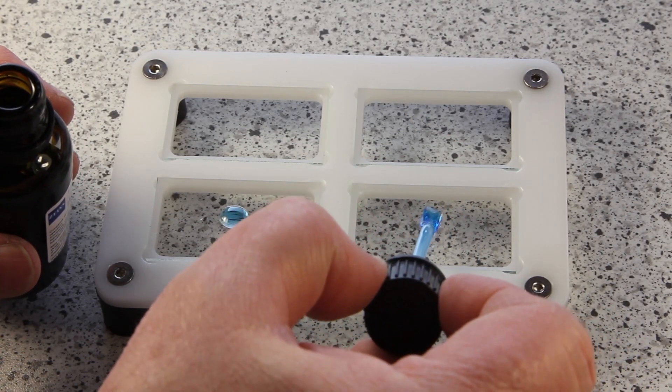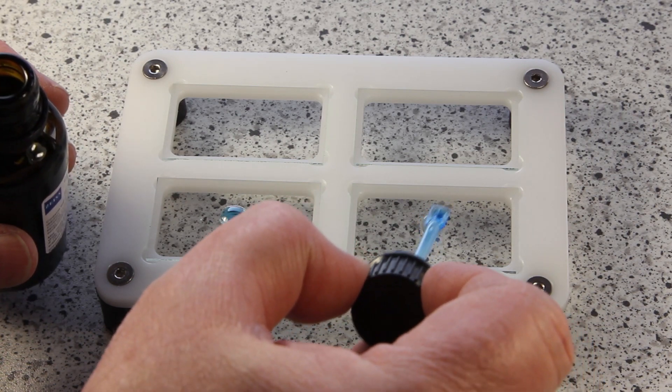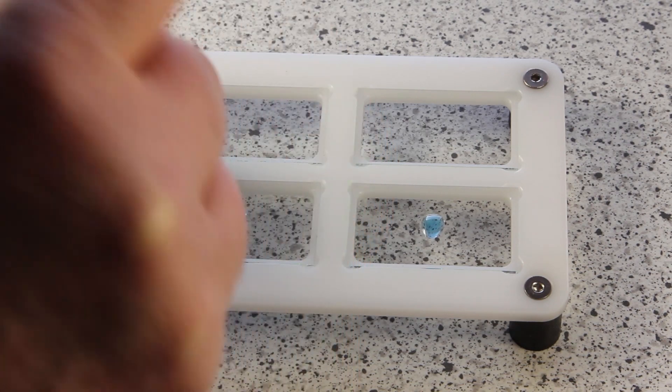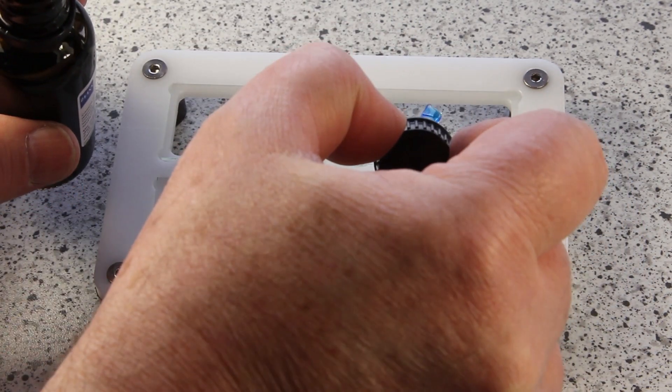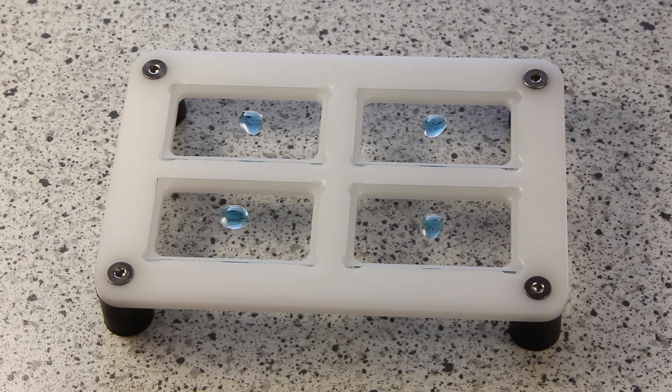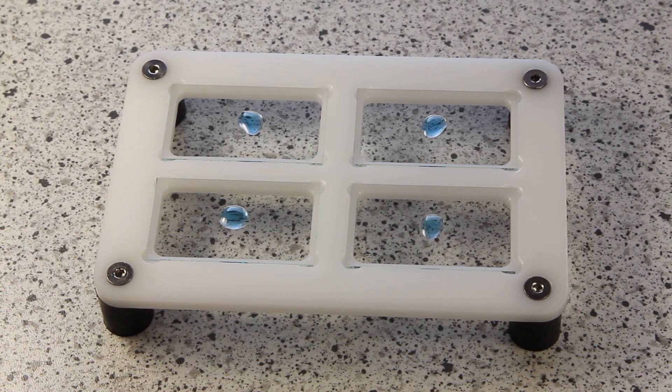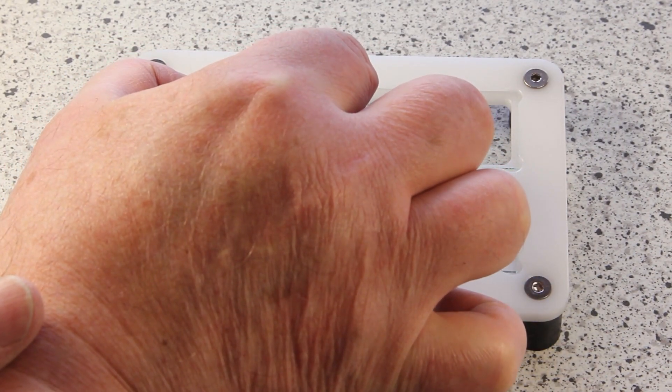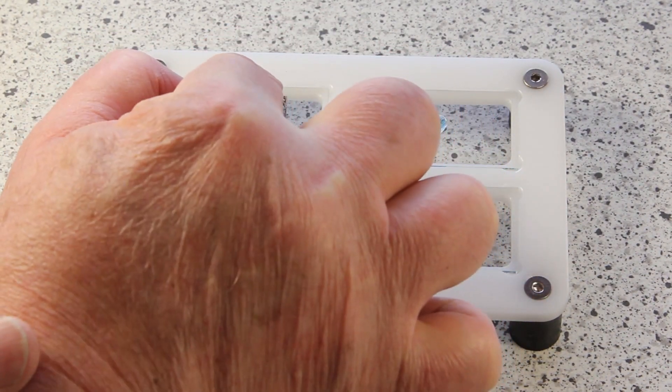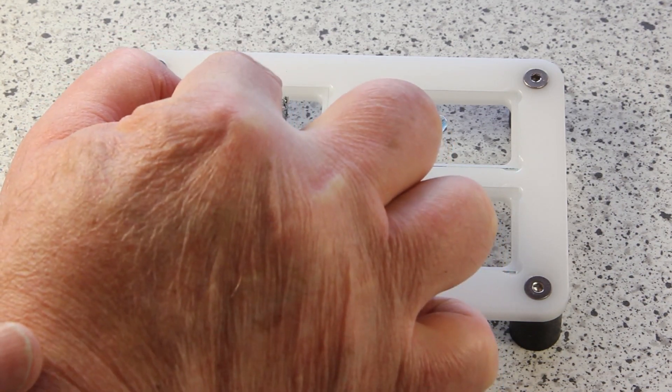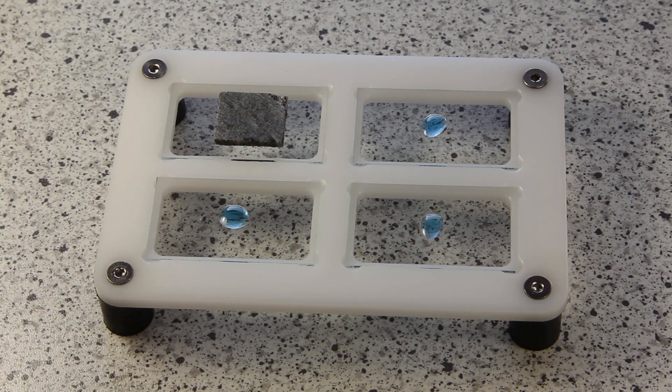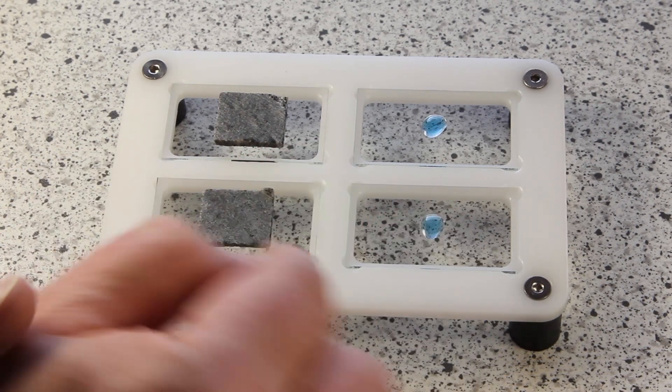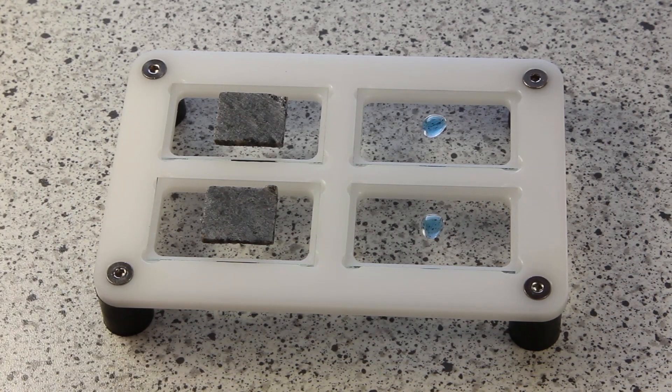I put a little drop of EPOSPIT-S on the middle of each slide. The uncured EPOSPIT-S is blue. And now I collocate on each slide a sample with a flat side down, like this, straight in the middle.